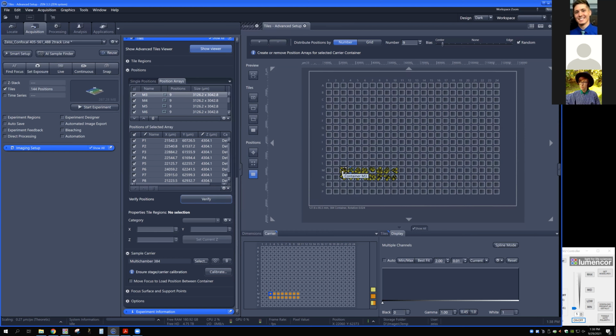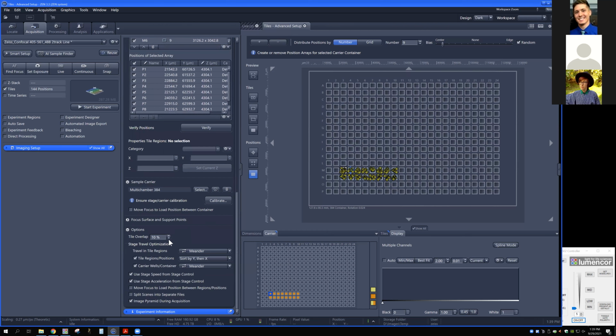What I would like to do is set up an experiment where we have all of this in place with the focus strategy so that you can see it start to finish. We do have about 20 minutes left in this session, but we have some optimization to go in terms of getting this working and figuring out exactly what we want to do. Honestly, if nobody has any other questions, I can't really think of anything else to mention here that will be relevant until you really start working with it.